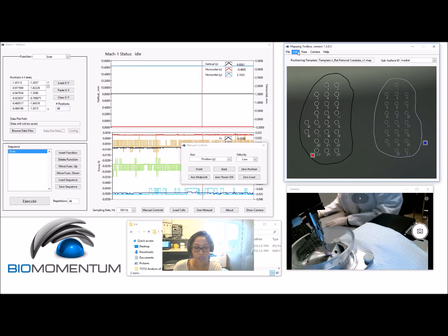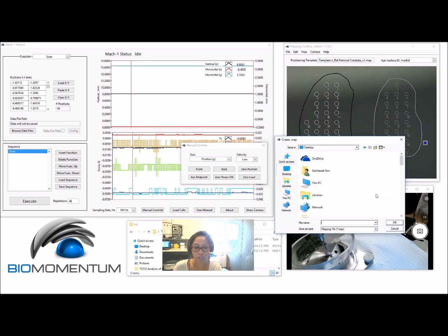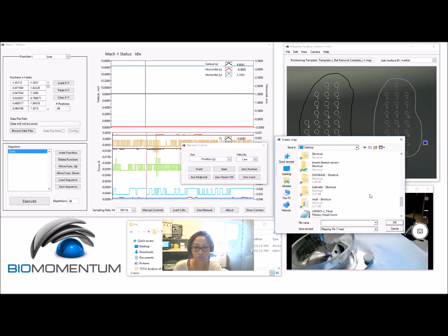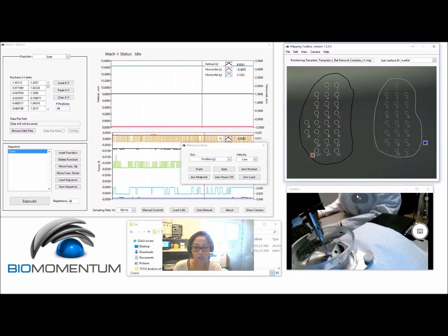To create a dimensioning map file, choose Create Map. The metric coordinates of the two reference marks and those of each position of the grid will be saved.